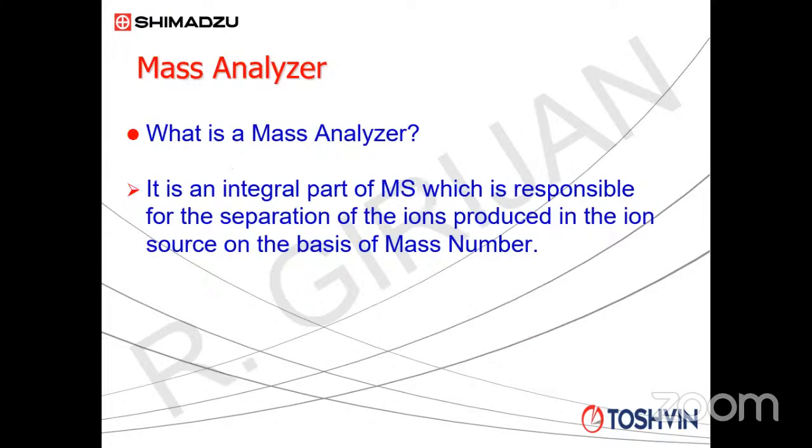So you can have a very, very sensitive analysis for electrophilic compounds, even though they are present in extremely low concentration. So after the ion source, now these are the three major ionization techniques in GCMS: electron impact ionization, which is the most widely used one; positive chemical ionization to understand the molecular weight; and negative chemical ionization for the analysis of electrophilic compounds at trace level.